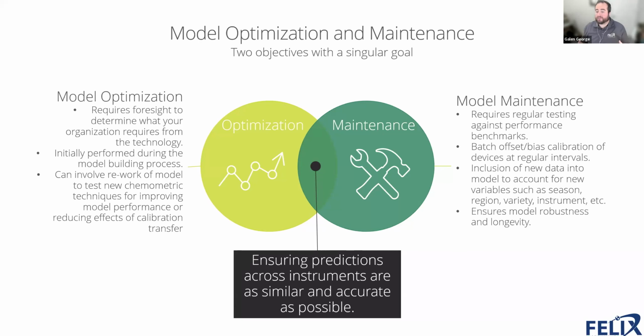so that all you're doing is making your model so much more robust. And the good news is that most research shows that after about 3 seasons, with 4 seasons being the gold standard, you start to lose that seasonality effect in a new model. So all the models that we've built in-house encompass upwards of 4 to 5 seasons worth of data, because we want to make sure that year over year, these models aren't going to be consistently changing.